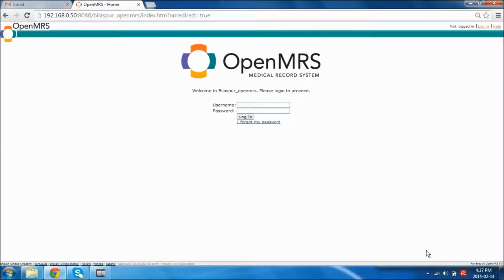In this session, we will talk about laboratory metadata and the customization involved. In the HIS, the laboratory module will operate for all lab services, all investigations, requisitions, and lab orders. These lab orders will be routed to the lab module through the billing module, which means the user needs to pay for those tests and then the queue will move to lab for performing those tests.